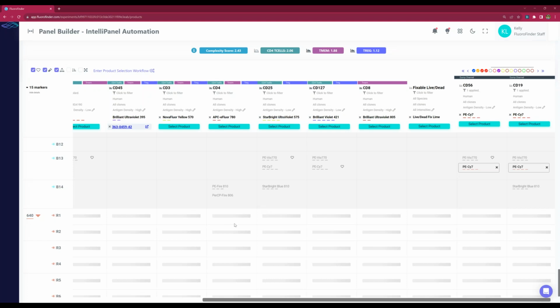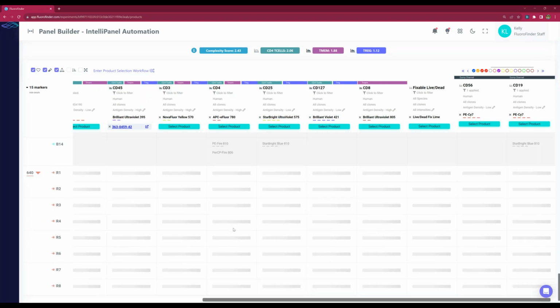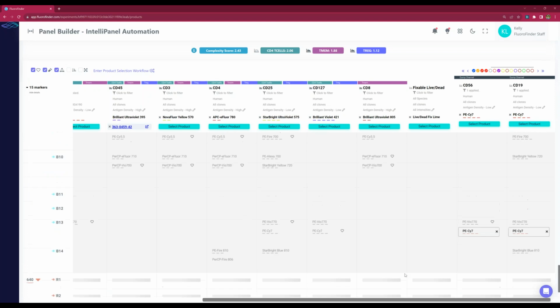Yeah, I was actually just working on that this week, going through our entire database and working out which of these reagents are the same, so that you can go to the dye directory, search for APC Cy7 and find an equivalent fluor that's identical from all the manufacturers. That's the first place to start. Doing that visually as a poster is really hard, but I could see us making a more integrated tool.